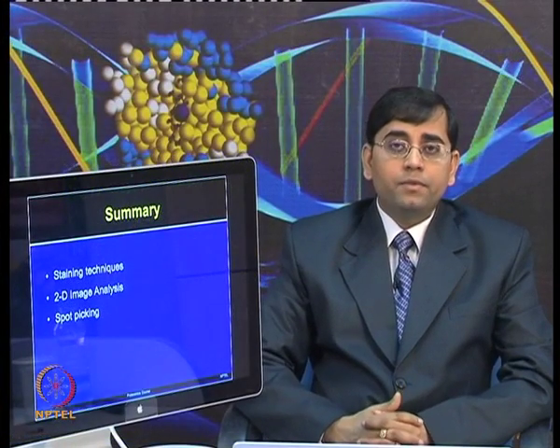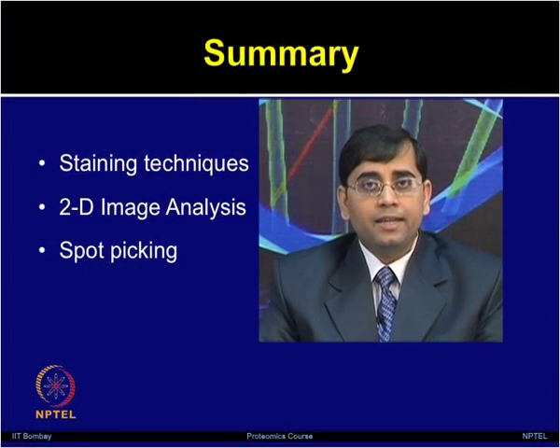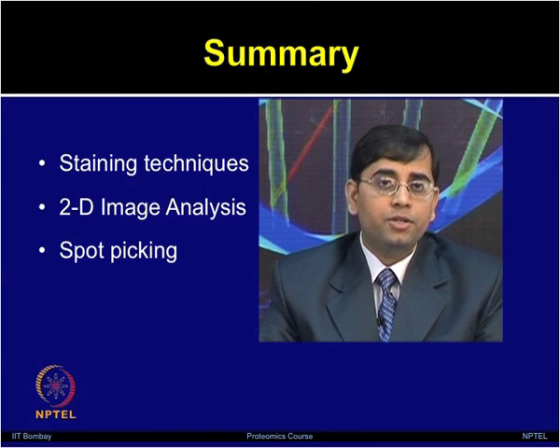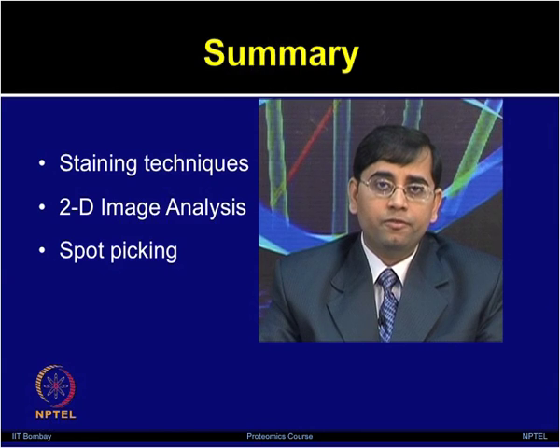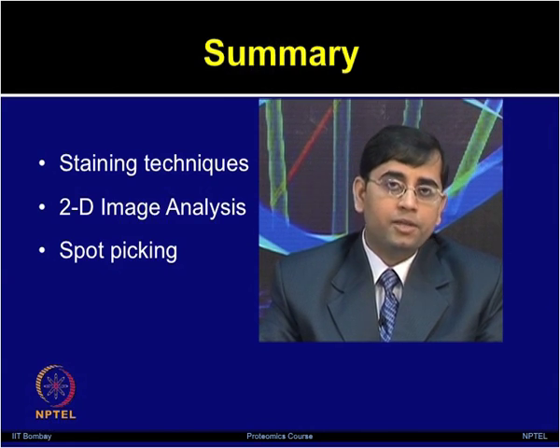So, in summary, in today's lecture we have talked about the different types of staining techniques available, which you can use depending upon your application, how to compare and analyze your two-dimensional images obtained from different samples from control and treatments, how to excise the spots, and then we briefly looked at some variations or advanced forms of gel based proteomic methods such as off-gel fractionation.